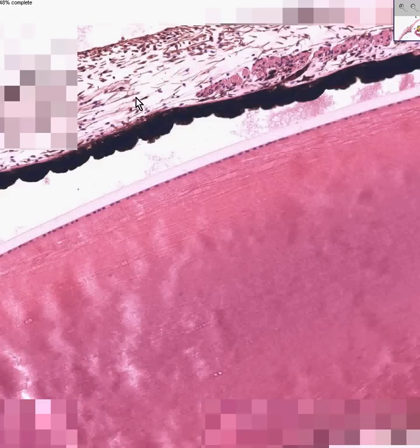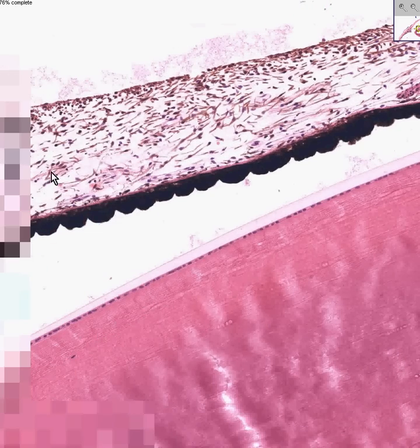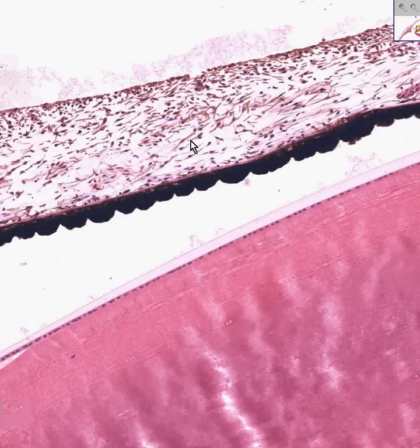And then you'll occasionally see more proximally in the iris, other little bundles of smooth muscle. And that would be the dilator. And they're under sympathetic control.